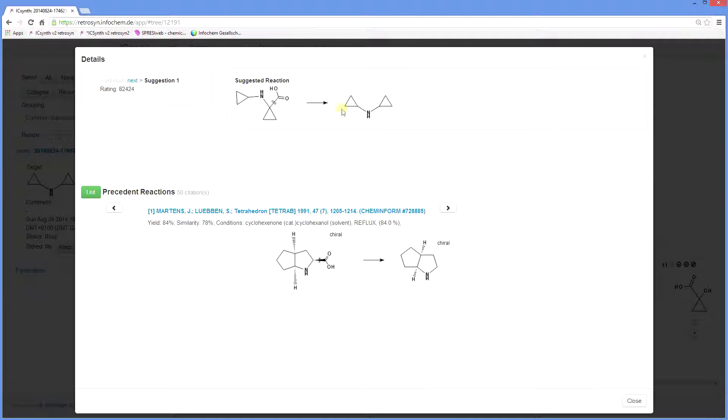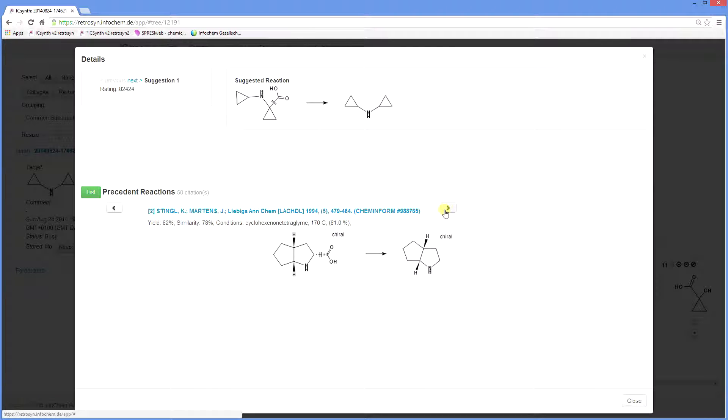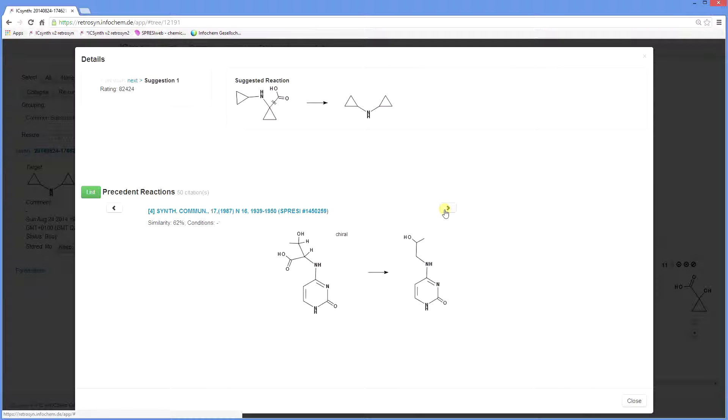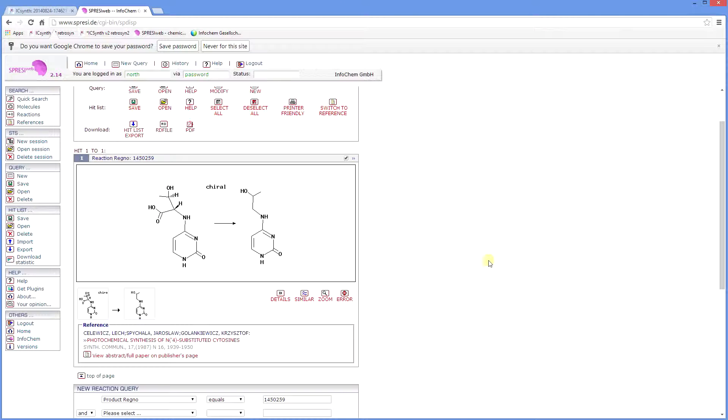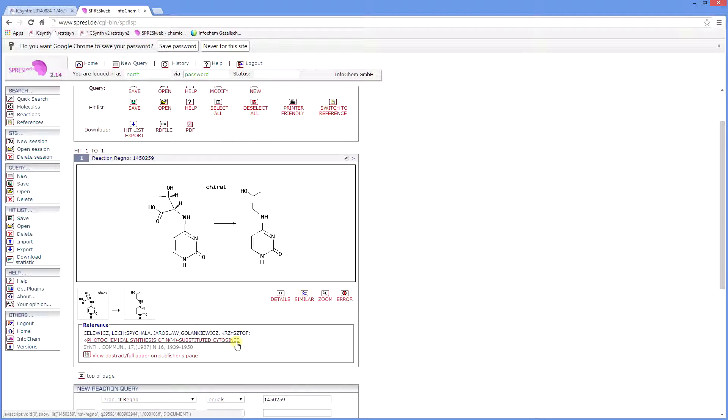The suggested reactions are based on and linked to published reactions that were used to create the knowledge base. Here you see the suggested reaction and the precedent reactions along with their references. You can then scroll through the list and decide whether the chemistry is of relevance. If you see a reference has derived from the Spresi database, you can click on the link and log into the Spresi database to see further information about the reference.